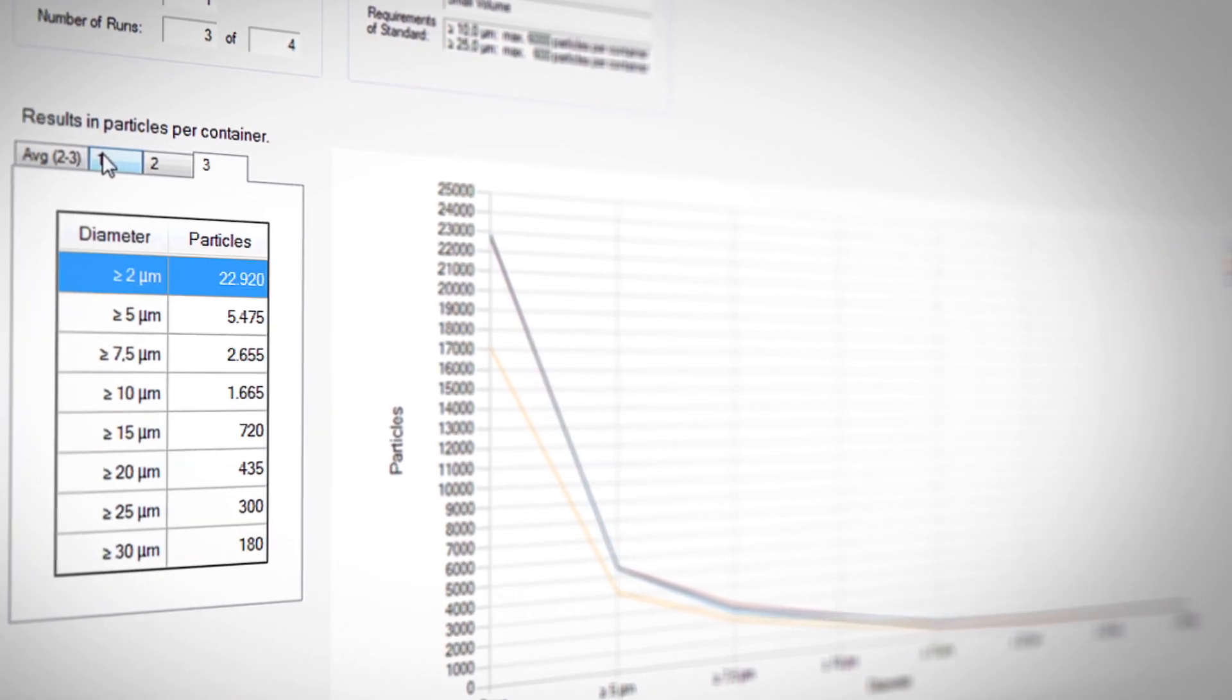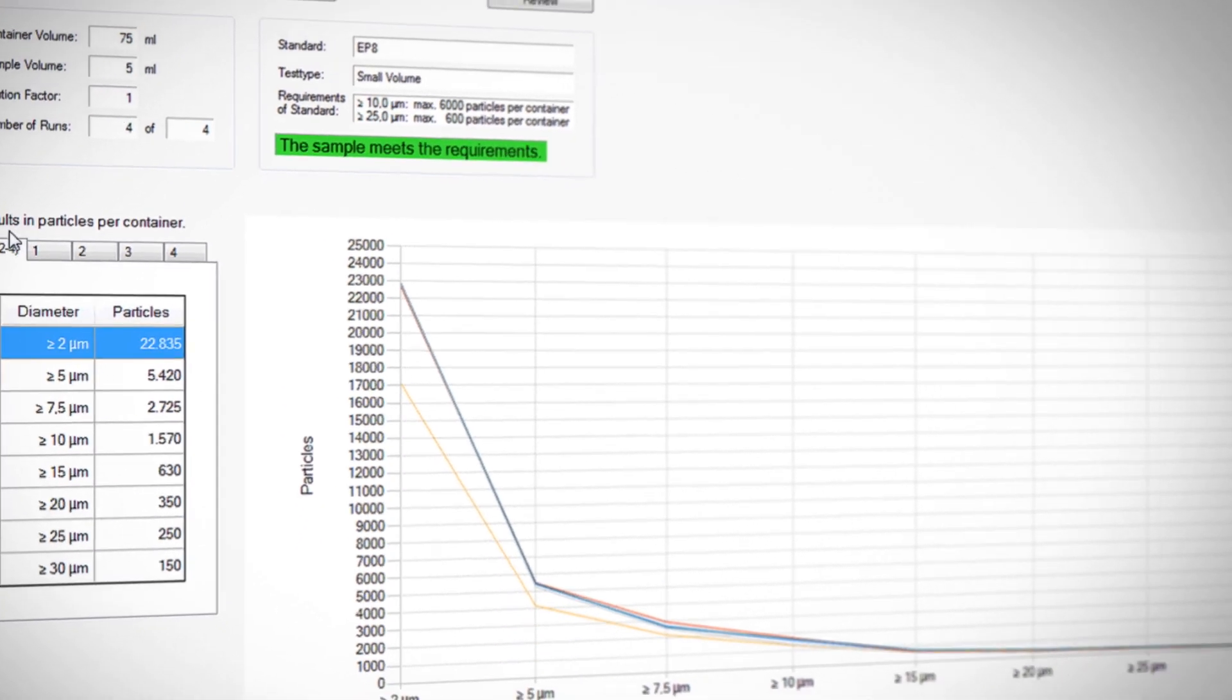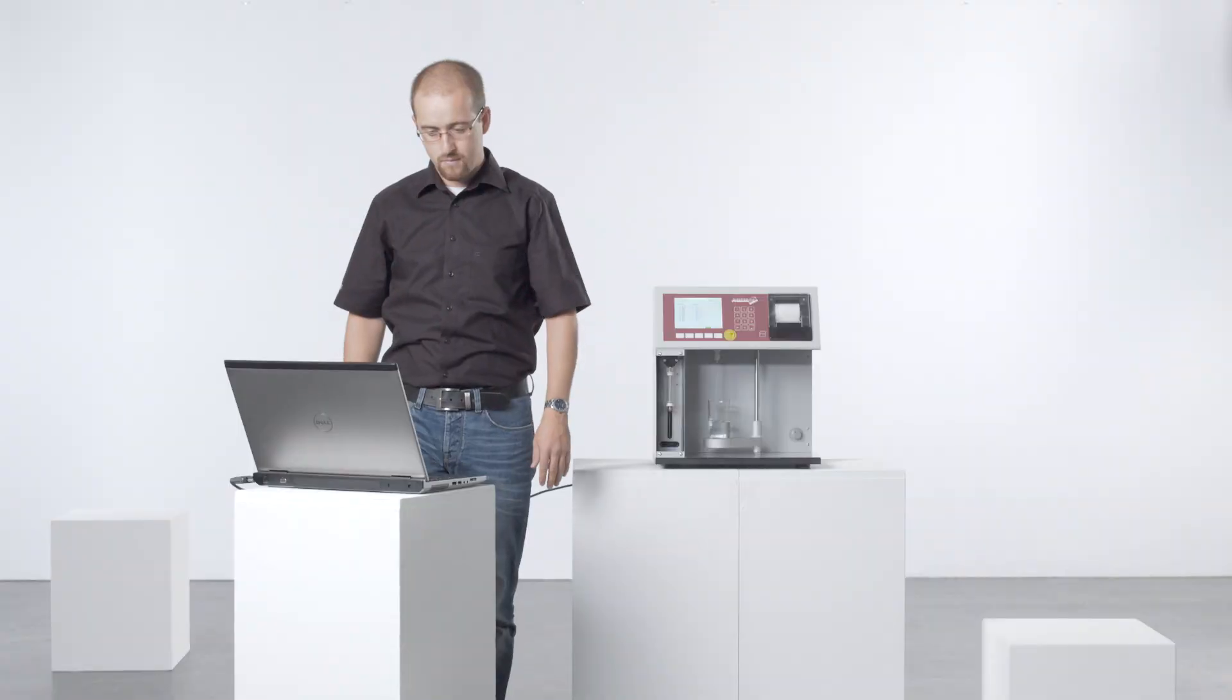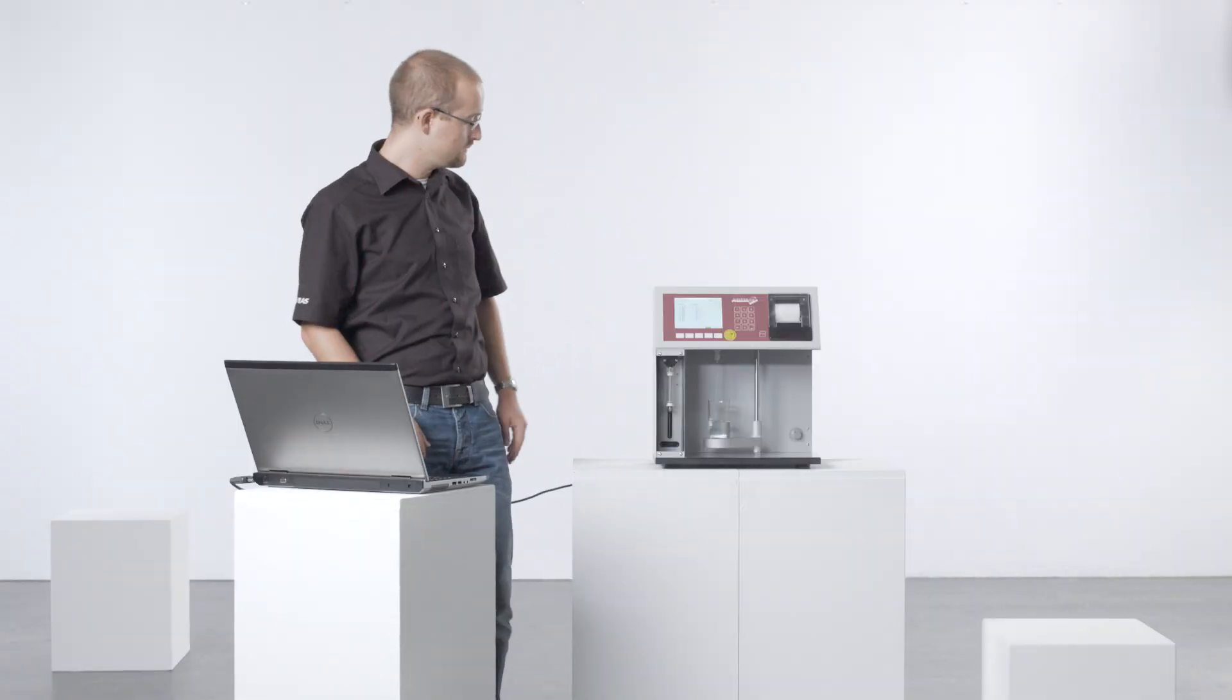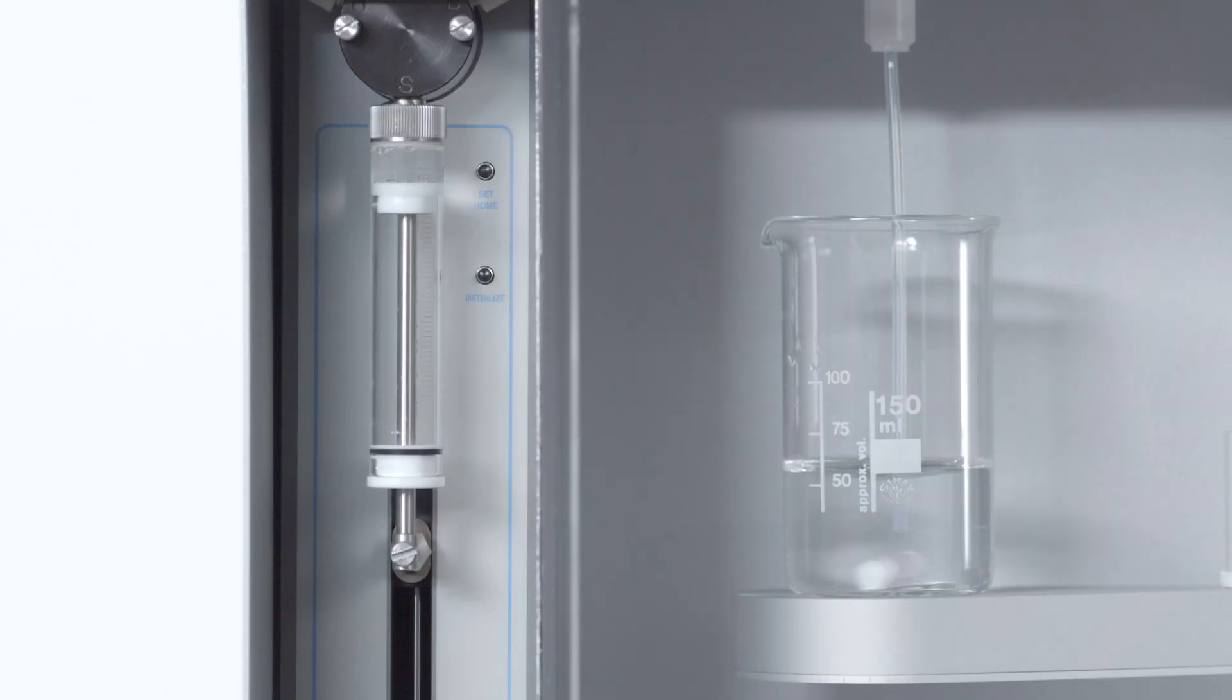The particle counting system can be used as a standalone instrument or via a PC laptop with software. All analysis data is displayed on the integrated LCD monitor.